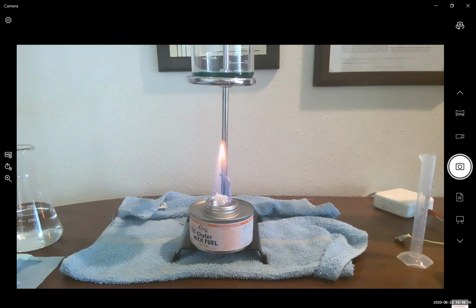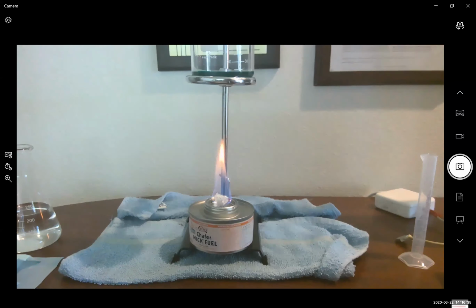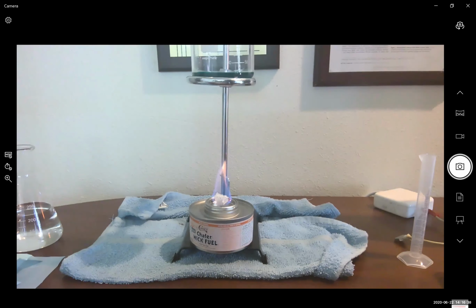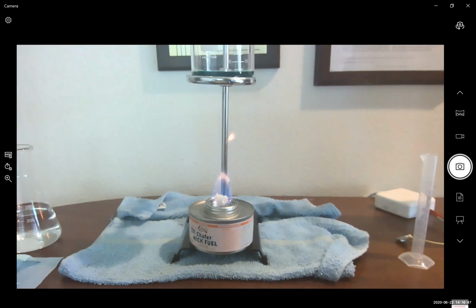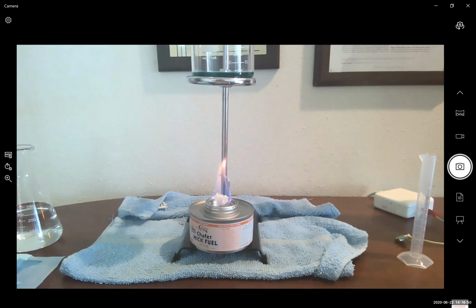Now, once it's going, you're not to touch the sterno cup at all during this procedure, nor are you to touch the beaker except at the top after you've extinguished the flame with a towel. That is why we have a towel handy and ready to go for this experiment, to grab the top of my beaker at the end. Again, keep this entire setup away from any open flames or other flammable objects.